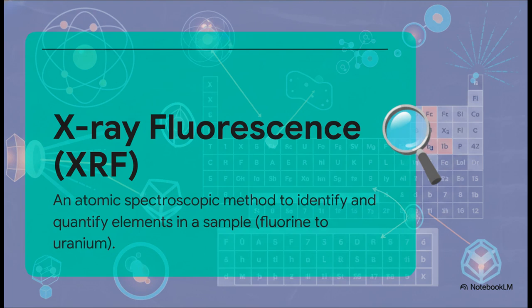It honestly couldn't care less about crystal structure. You can throw solids at it, liquids, crystalline stuff, non-crystalline stuff, it doesn't matter. Its one and only job is to identify and count the atoms of every element present.